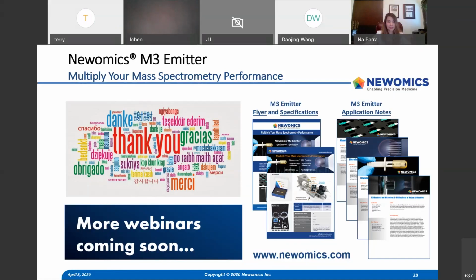Good question. For native MS, people use aqueous solution because we want to maintain a native state. We have other application nodes: bottom up proteomics, targeted proteomics, and lipidomics. They all use organic solvent, acetonitrile, running gradient. We also work on really high organic solvent. For example, previously we collaborated with one collaborator to run 300 pesticides. Those are really high organic.